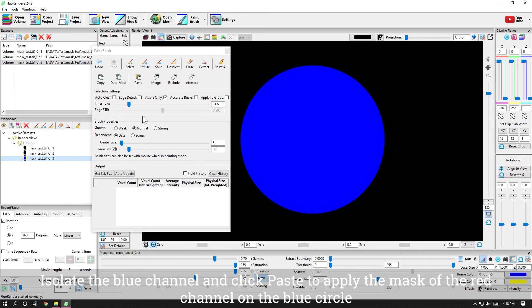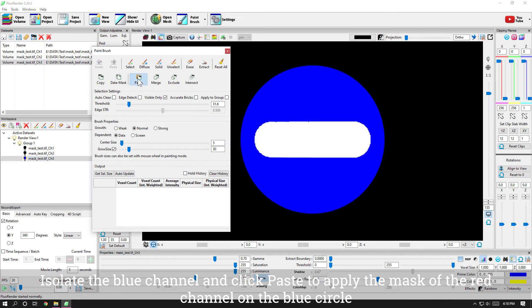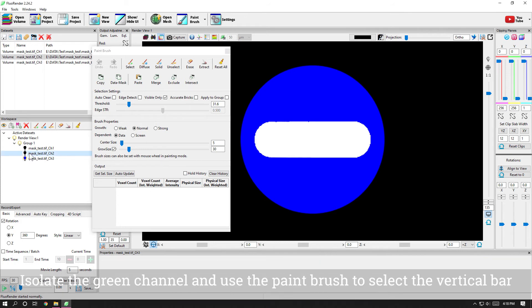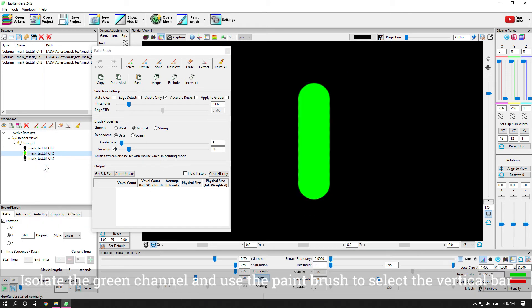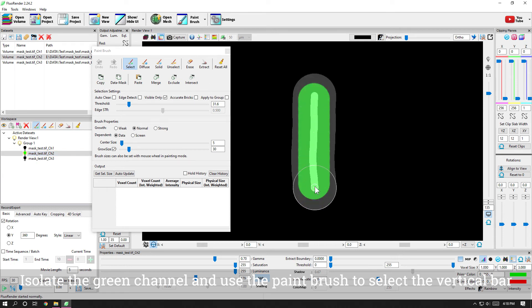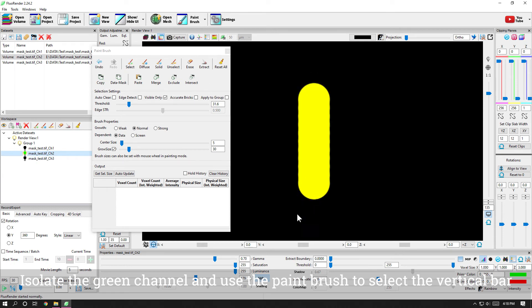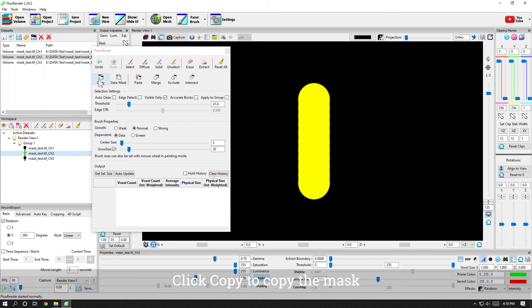Isolate the blue channel and click paste to apply the mask of the red channel on the blue circle. Isolate the green channel and use the paintbrush to select the vertical bar. Click copy to copy the mask.